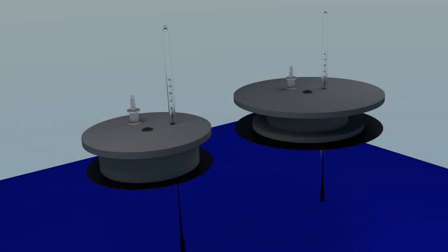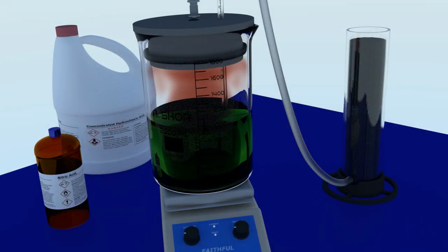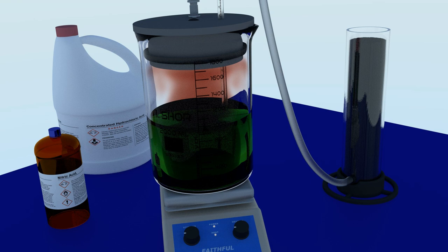Beaker stoppers. These stoppers are designed to be employed when very harsh chemicals are used. They will even withstand exposure to highly corrosive fumes. Excellent for use with aqua regia solutions in both gold and platinum refining.